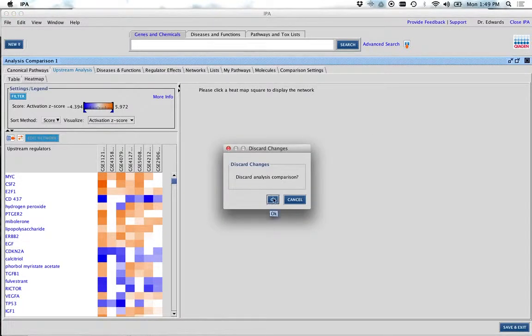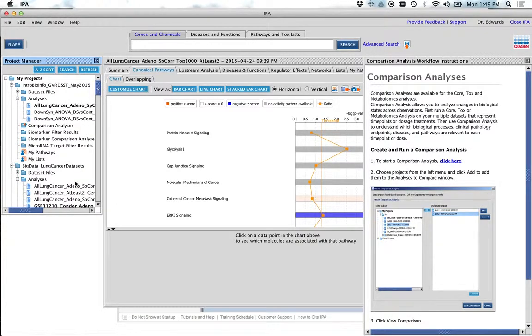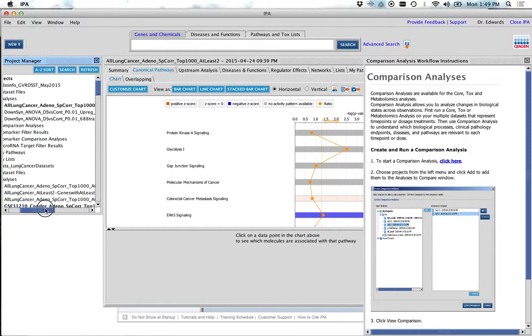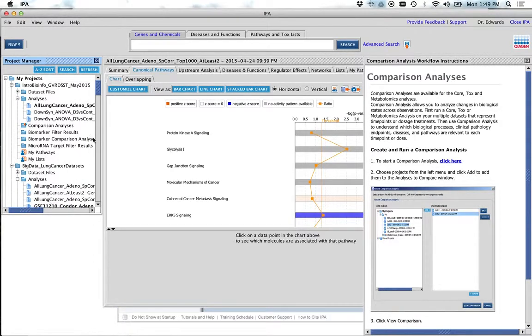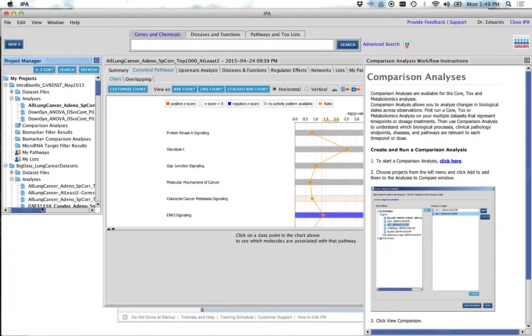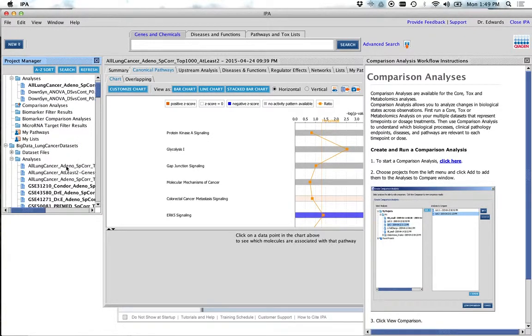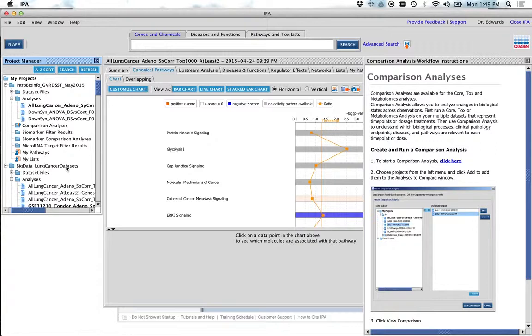Is your data set downloaded now? Is it bold? Yes. Okay. I want you to click it. Double click. Is that the one? No? Where did I put it? Oh, did I make a new project? Oh, I put it in the intro to bio. Oh, well.